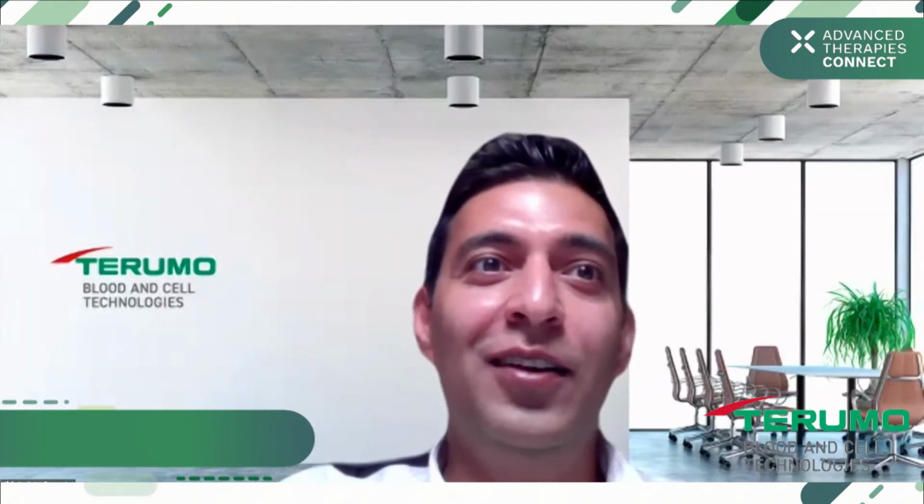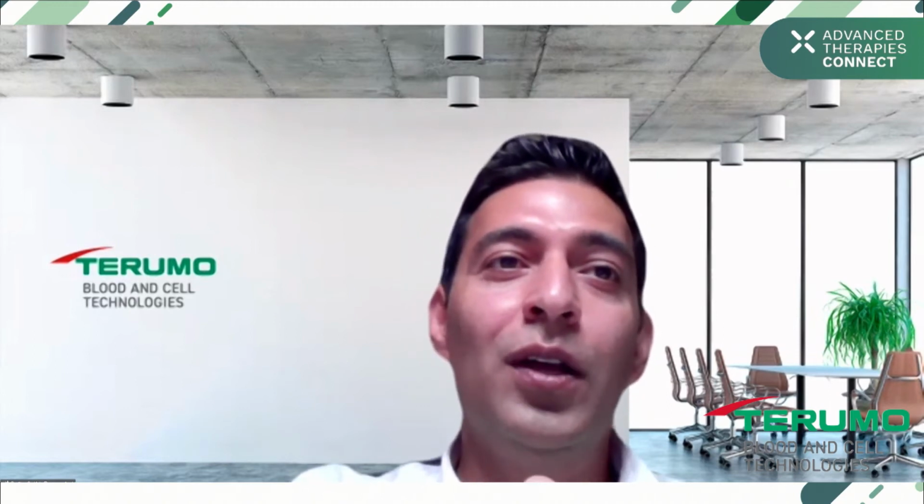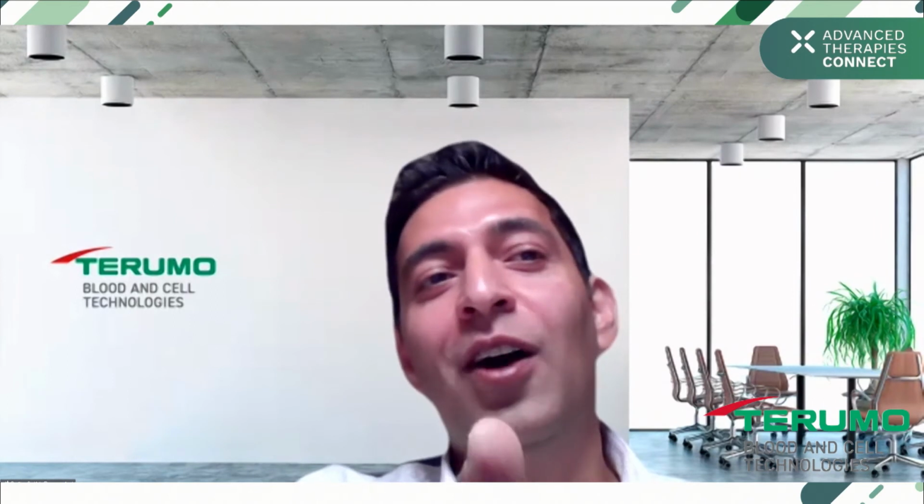So, thank you, Elvin. And with that topic, I will go to Zelina, because Zelina talks about automation of the whole process, including robotics. So when we think about modular automation and integrated automation, we touch two points. You can have every process integrated into one system, or you can have modular systems integrated through robotics. So what are your thoughts, Zelina, on this? I know you raised your hand, so I'm very keen on learning from you. How do you think those automation technologies work together to take this field forward?